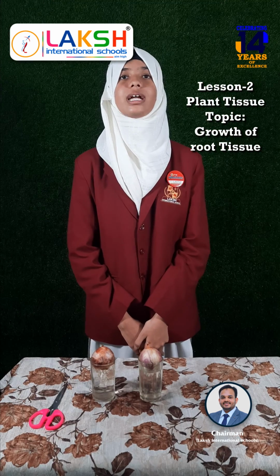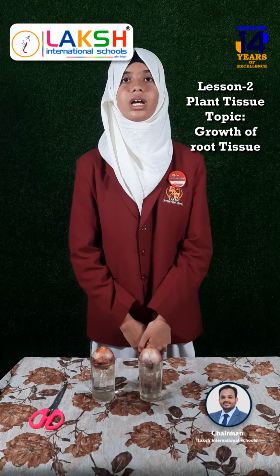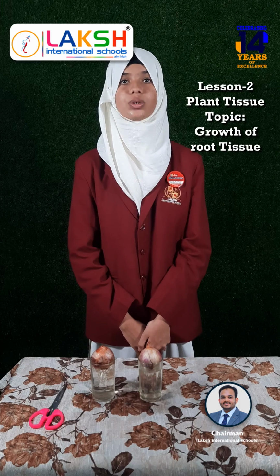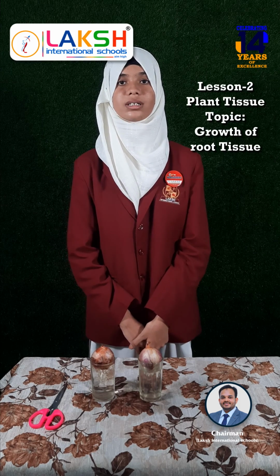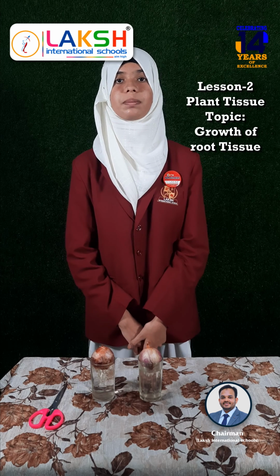We concluded that the root tip of onion has a specific type of tissue called meristematic tissue, which causes the growth of plant. Meristematic tissue is a group of cells that divides and grows continuously and hence causes a plant to grow.